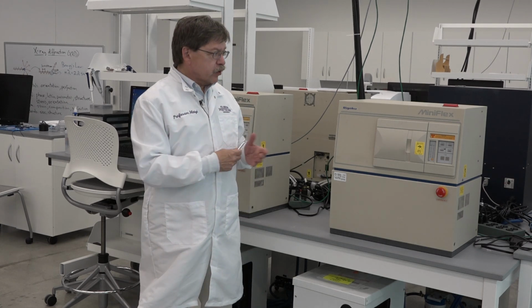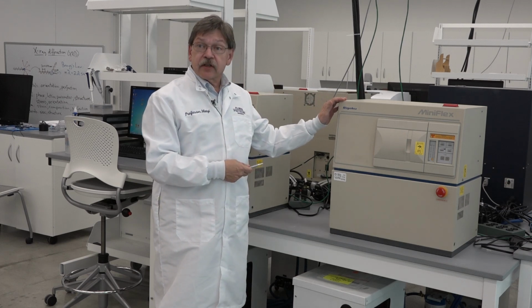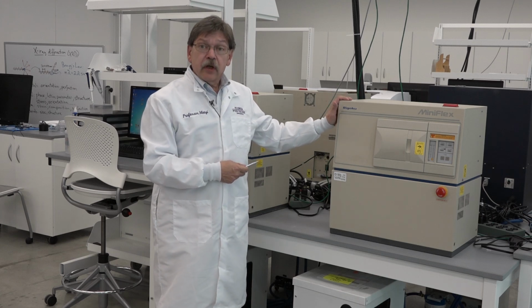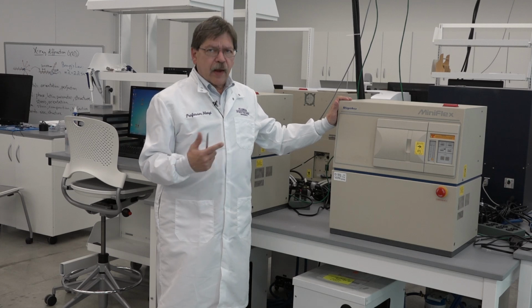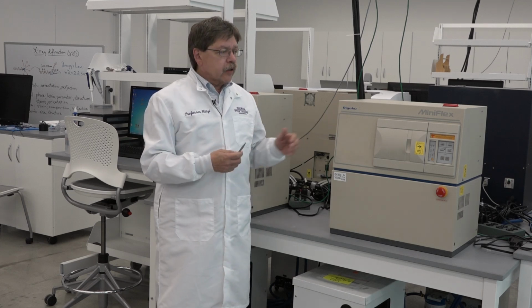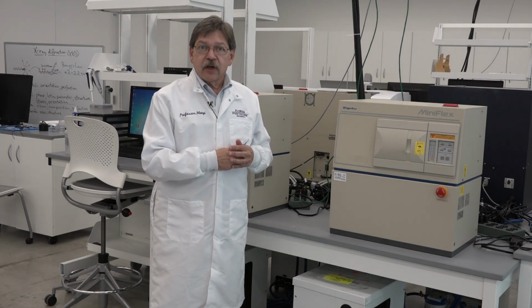Okay, I'm standing in front of the first portion of our acquisition from Rigaku Americas. What you see here is a set of 4 Rigaku MiniFlex X-ray powder diffractometers. This is obviously a tabletop tool. It's used very widely out there for quality control, rapid turnaround materials analysis, a range of applications. And Rigaku recognized early on that instruments like this might be very well suited for our undergraduate teaching mission.